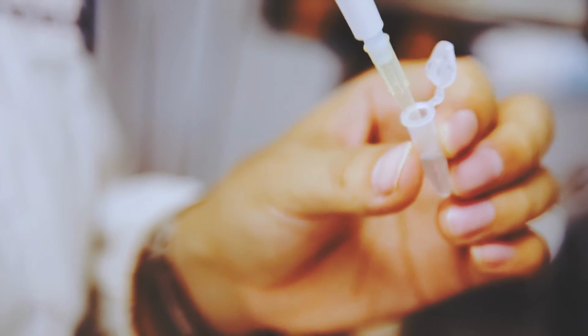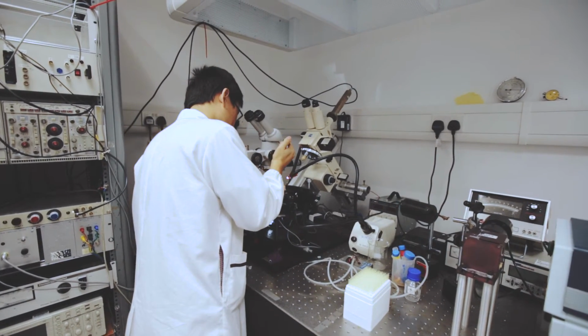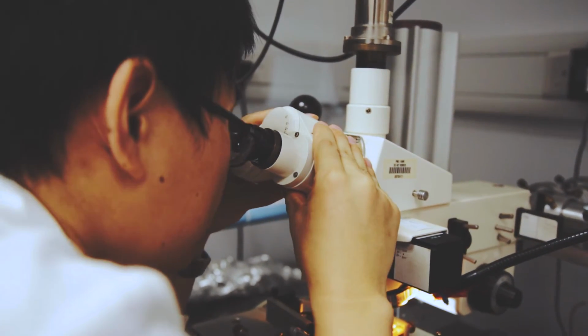Most of the experiments that I have been doing in the past involve using muscle fibers, which are single muscle cells. But we are building a new machine which allows us to measure the performance of what we call myofibrils. The main advantage is that we can do experiments on much smaller amounts of material, which then makes the material much more available. And so we can look at a wider range of diseases and conditions. But there's another potential use of this machine.